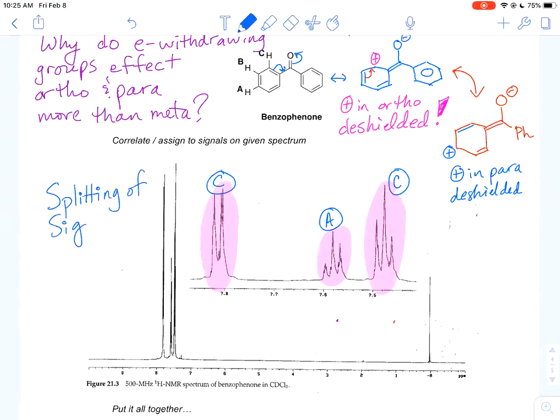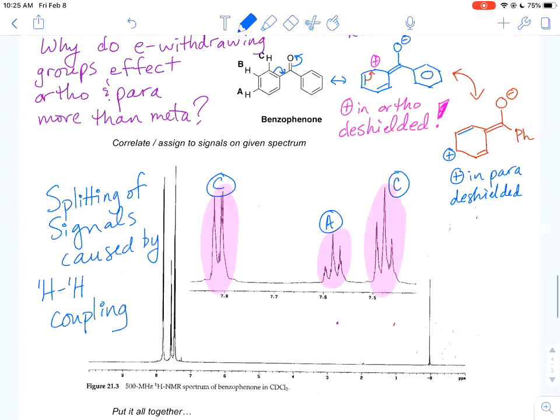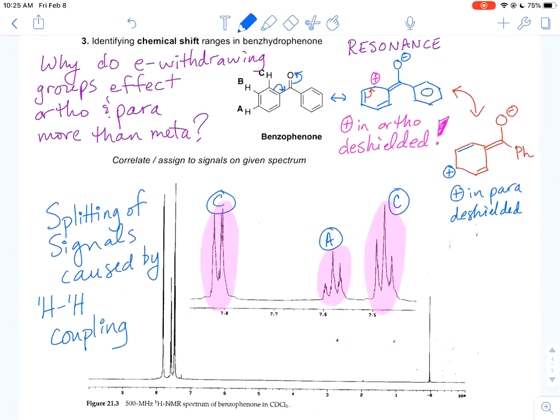This is caused by something called proton to proton coupling. Now for right now, I'm not going to explain the phenomenon of how or what the coupling actually is. I'm just going to give a brief explanation of which particular shape it has taken.